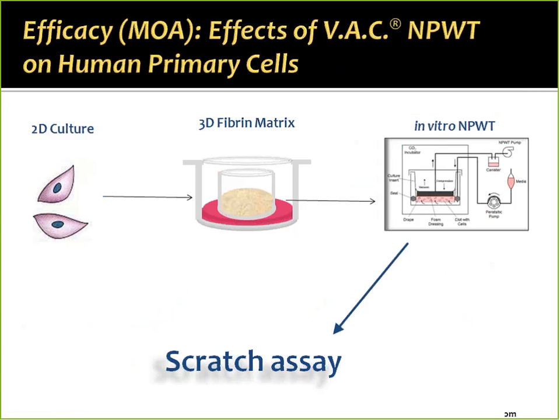So we focus on two major things. One is efficacy, right? How does the V.A.C therapy work on human primary cells in vitro? How can we improve upon those mechanisms of action? The other thing that we really focus on is safety.